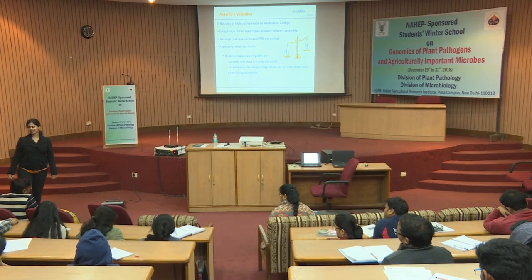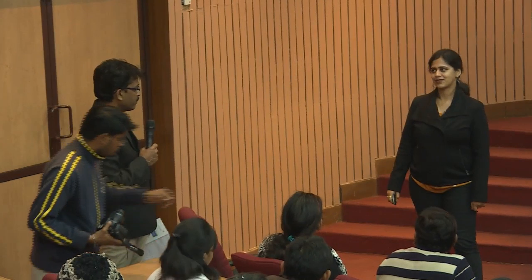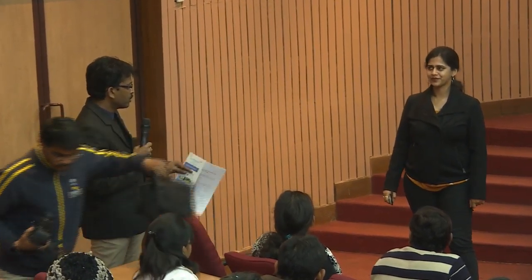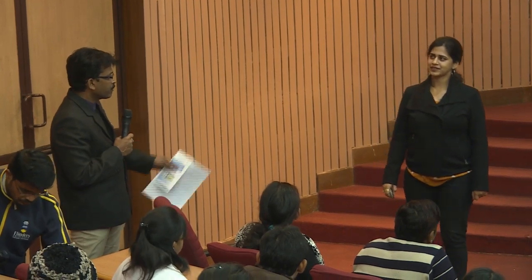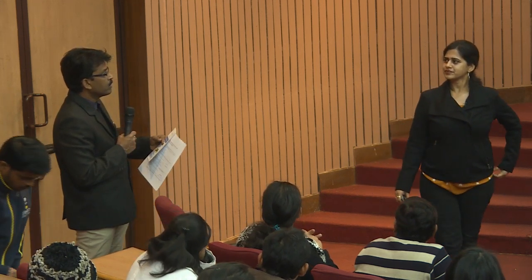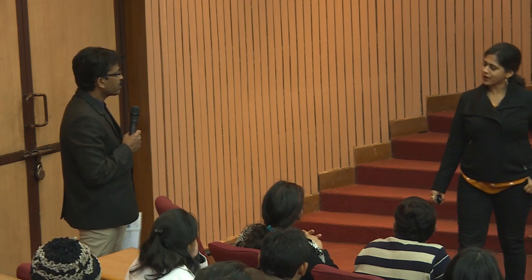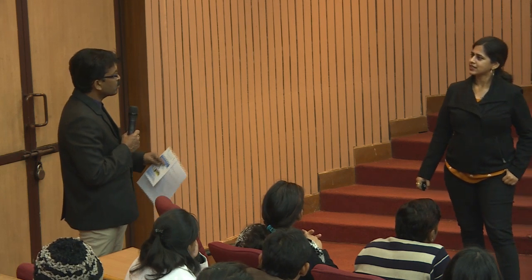Right, exactly. This error correction is through software only, it is not manual, correct? Typically, it is software. You use Illumina reads, which have a very high accuracy rate, with the PacBio reads, which have random errors. There are different software tools which can be used to eliminate these errors. So, that means you will be correcting the PacBio reads. Right. We do an error correction of the PacBio reads. That correction is done through software only, using your short read technology.